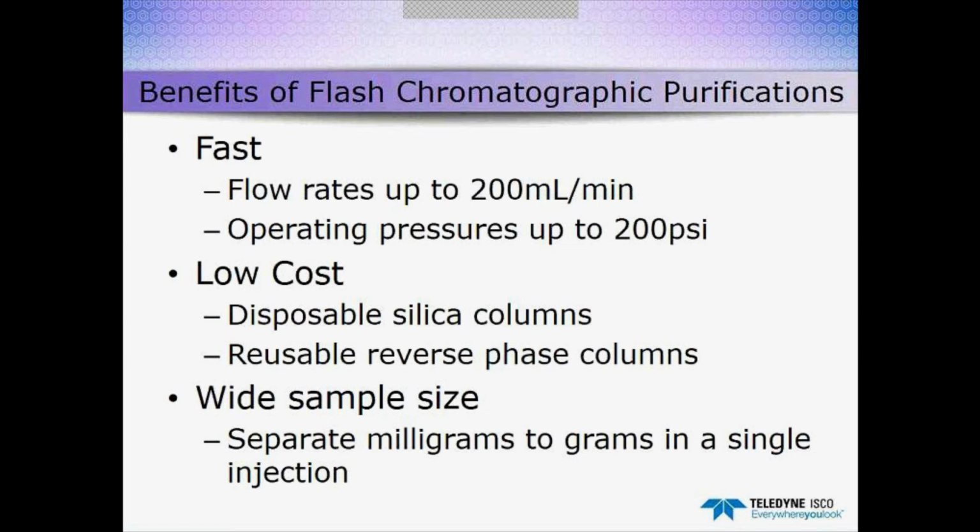In the last 5-6 years, there's been a lot of movement toward reusable reverse phase columns. And again, the media is a larger pore media, larger diameter particles, and therefore it's less expensive than preparative HPLC columns. But again, at the same time, they're reusable. So I've seen reverse phase columns in customer locations that have had well over 100 to 200 injections on them, and they're still performing well. Really, just like in HPLC, it depends upon the purity of the sample and the care that you take of your flash reverse phase column.